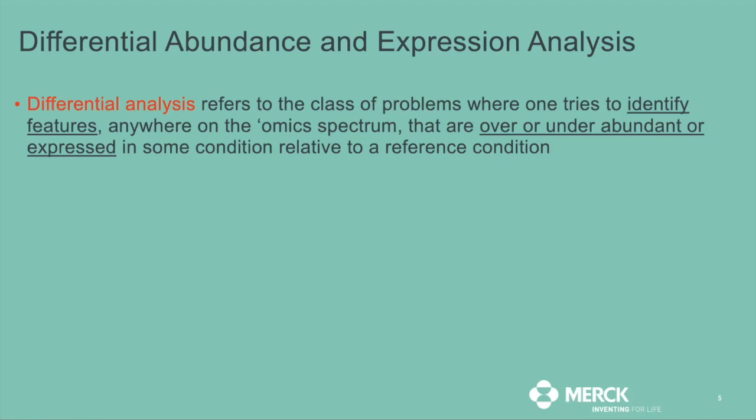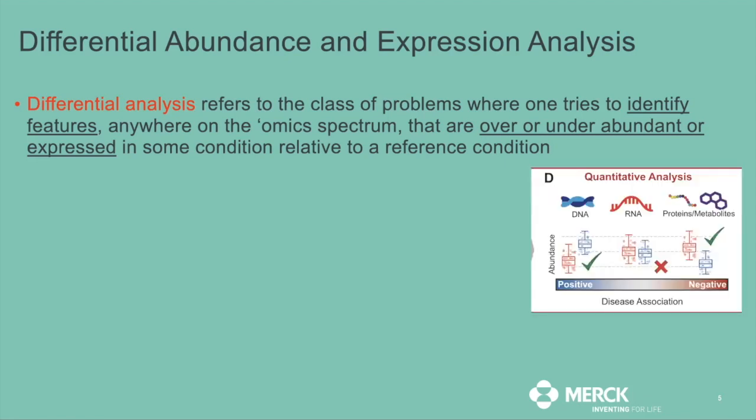Again, with this definition, I do need to pinpoint certain details about what I exactly mean by differential analysis, because in the microbiome community, there are several ways to do it. One can do some sort of omnibus testing based on alpha diversity or beta diversity, but the class of method that I am interested in is called per feature differential analysis. Arguably, with the per feature approach, the output is more granular, in the sense that you are able to tell which particular features are differentially abundant or expressed, as compared to some measure of the whole data set or the whole community, for example, diversity.